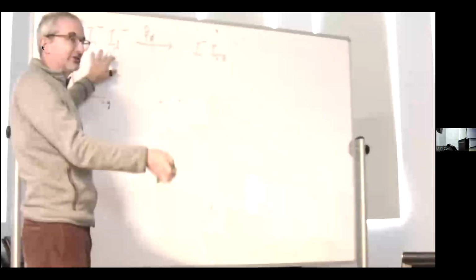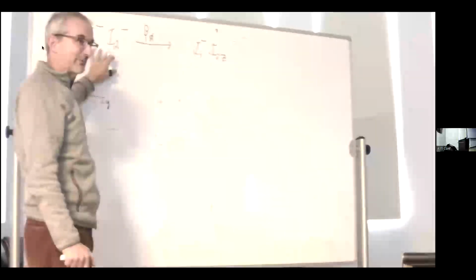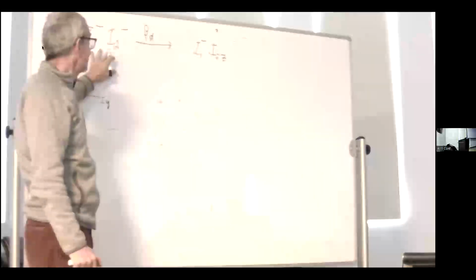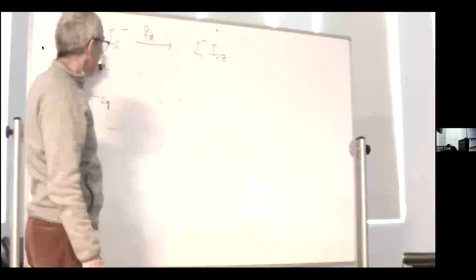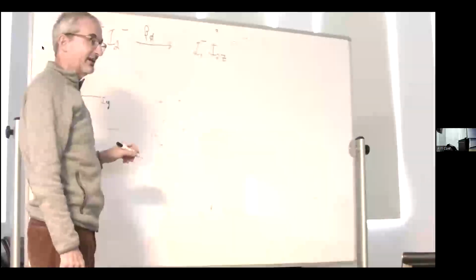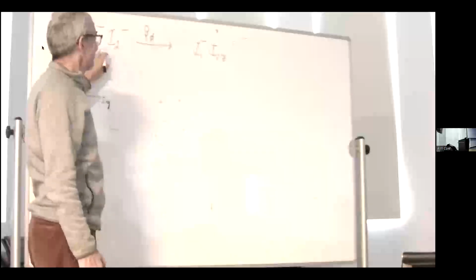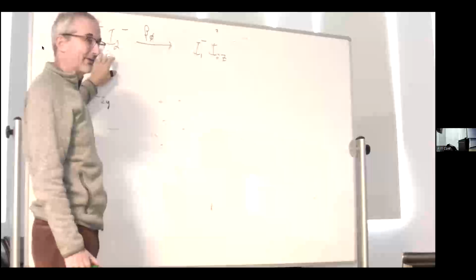And that means you just have to apply an X pulse of angle beta to those operators. And if we rotate these operators by minus phi around Z, we're either going to get plus I phi or minus I phi, depending on how this all works out.